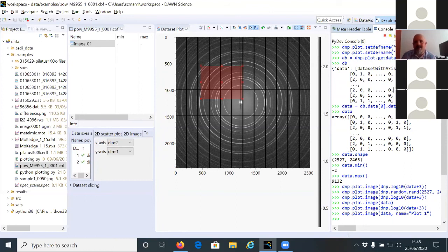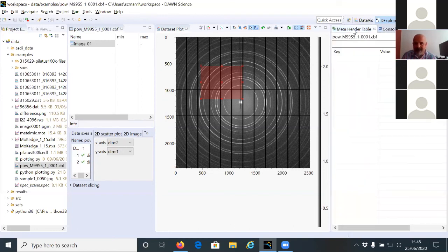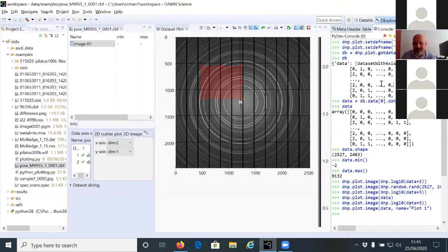So feel free to explore each view. Each of these tabs is a view, and each tab has a toolbar with different things. I am just a novice as well. I have been working with this for about a month now, but that's the way you learn. You just try to explore the different buttons and see what they are doing.